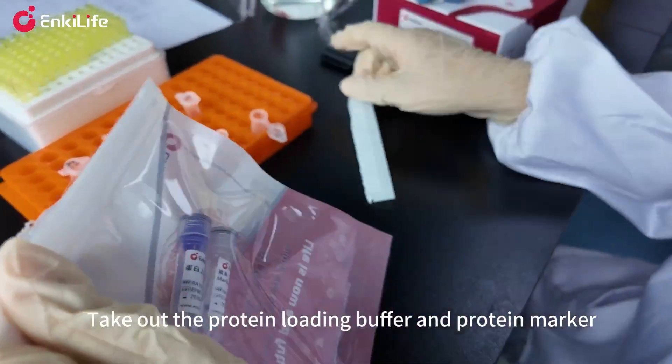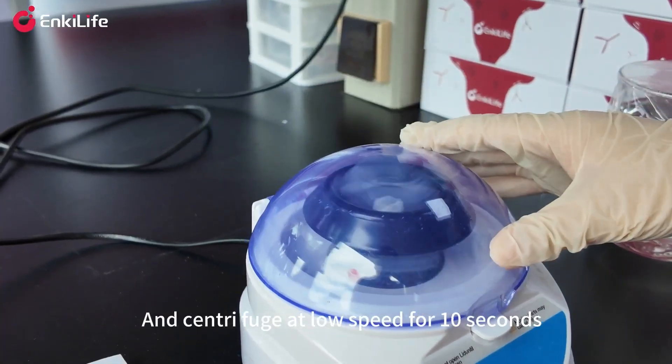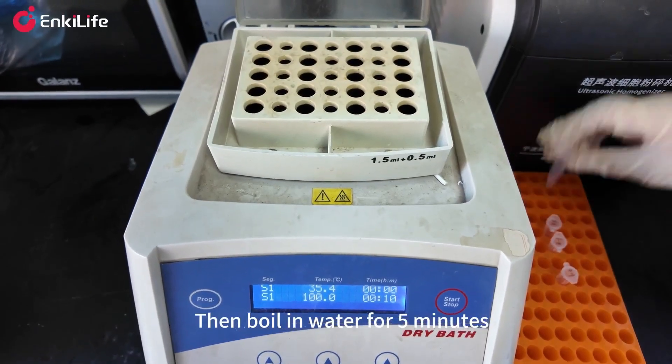Take out the protein loading buffer and protein marker and centrifuge at low speed for 10 seconds. Add one-fourth volume of protein loading buffer to the test sample, then boil in water for 5 minutes.